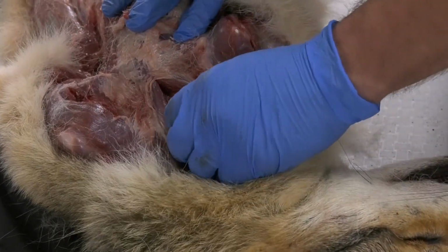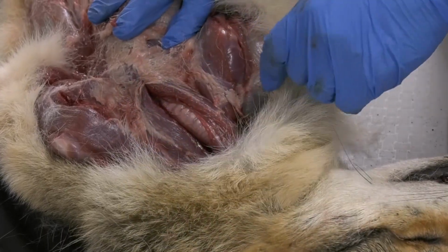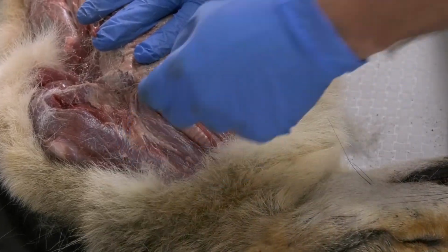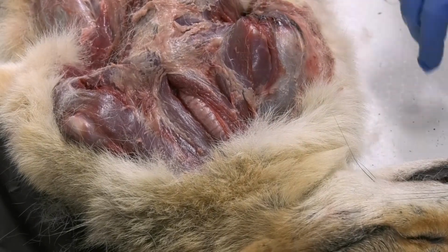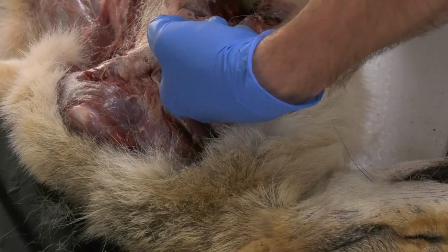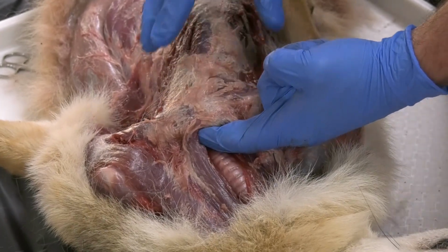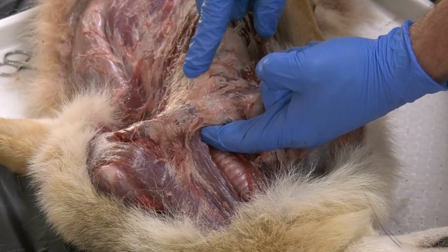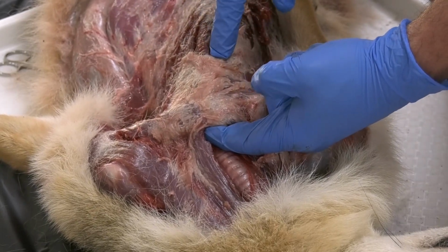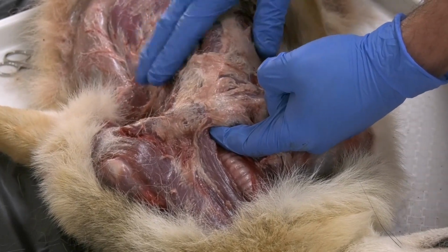So if we were to go a little bit deeper than this, we would find the esophagus sitting behind it. And you should have a couple of major cardiovascular vessels on either side of this trachea, a carotid artery and jugular vein. All right, so now this right here goes underneath the sternum and the rib cage is here. And accesses the lungs and the heart, which are underneath here. Now, this is gonna be tricky. We're not gonna be able to use the scalpel for this job. If we wanna see the lungs and the heart, we're gonna have to bring in some bigger guns.